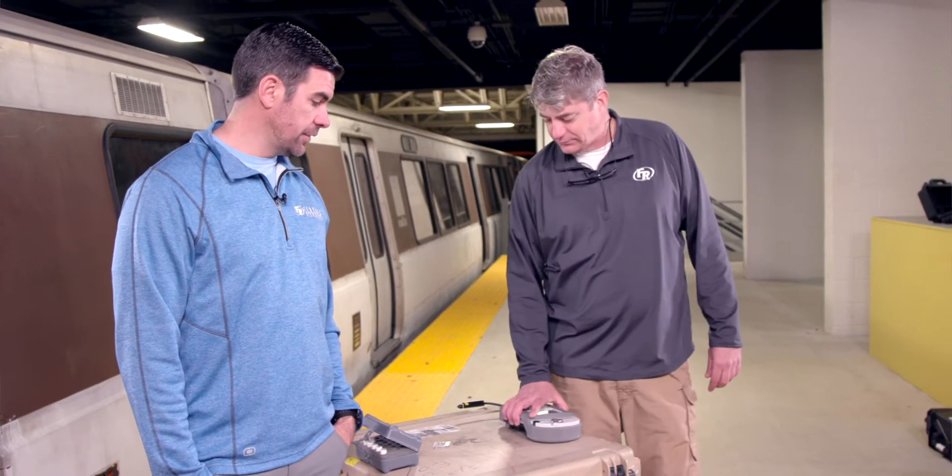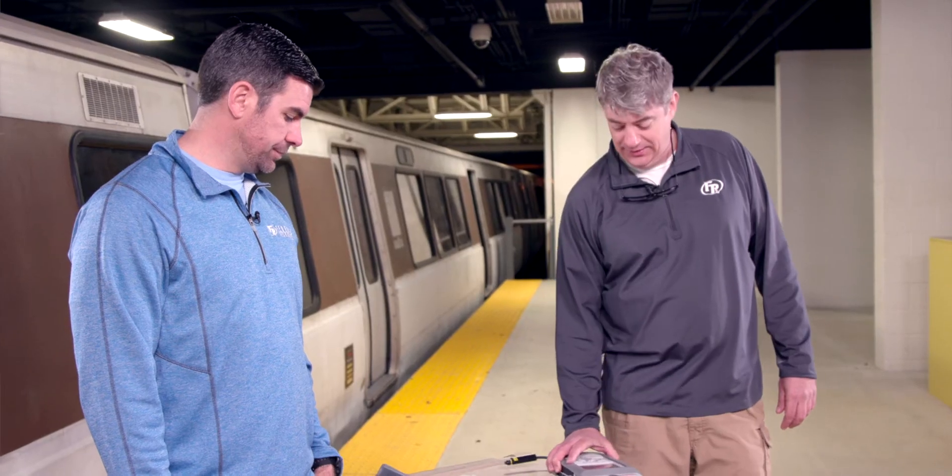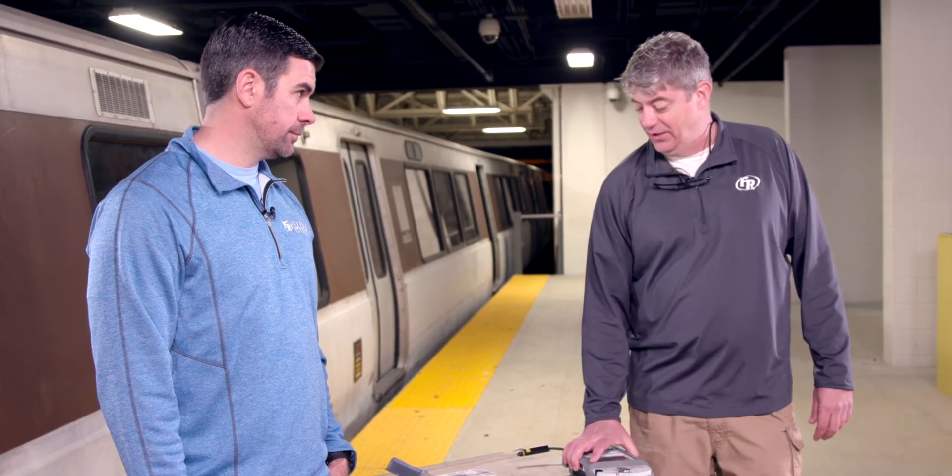Oh, here we go again. I was going to say good morning, but we don't do pleasantries, do we? We just jump right into it. Hello from the Guardian Center. I'm Alan Higgins. This is Dave Brown with Federal Resources. And today we're going to be discussing some safe sampling practices with the Gemini spectrometer.